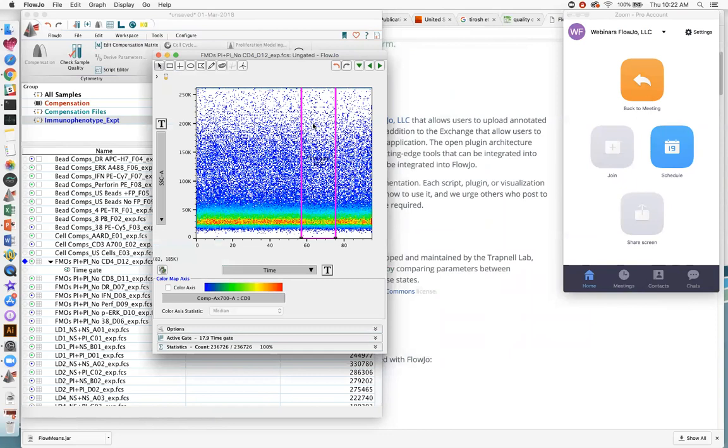And if you want to change this so that you chop out the data that are contained here and completely ignore what's going on, there are several options down here at the bottom of your graph window.